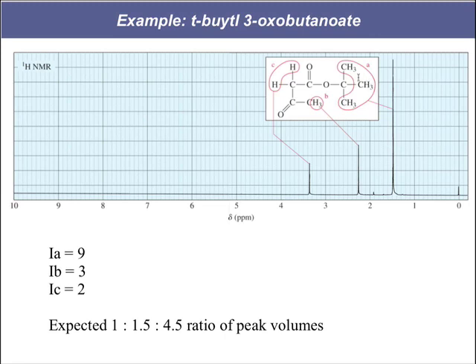So we've got hydrogens type A, we've got hydrogens type B, and we've got hydrogens type C. Now, as far as where their shifts should go, notice that B looks like a methyl ketone. These guys are on a carbon adjacent to a carbonyl, and we said that that should be about 2.1. Here it's about 2.2 or 2.3. But again, that's also because we've got more electronegative groups over here as well. So they should be maybe a little bit more downfield than we would normally expect.